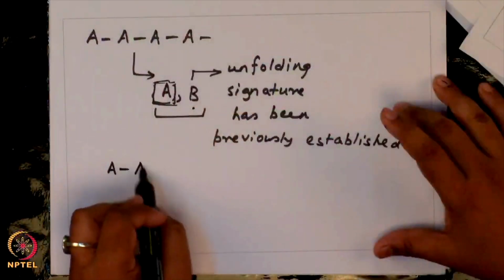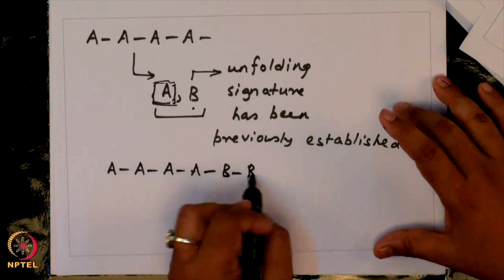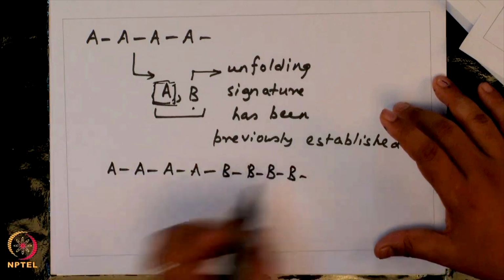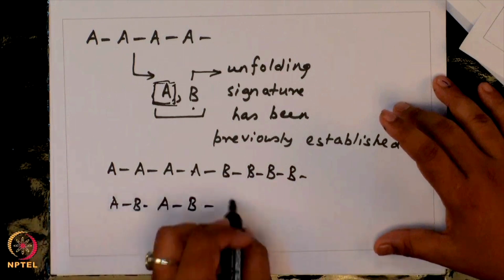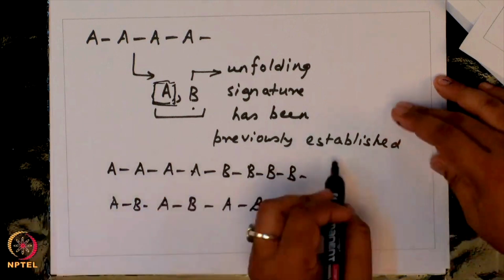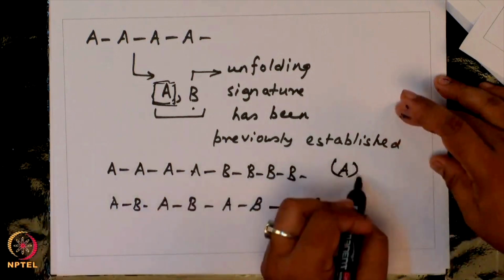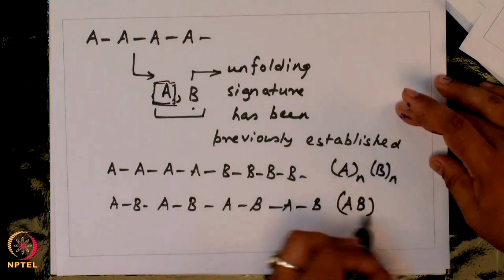Okay. Now, the next question is how do we design our multi-protein? Should we have a design like A followed by B, or AB, AB? In short, do I repeat A n times, B n times, or AB n times?